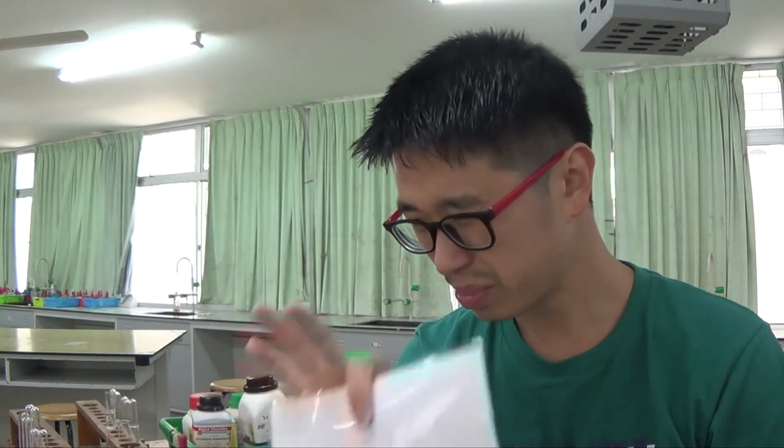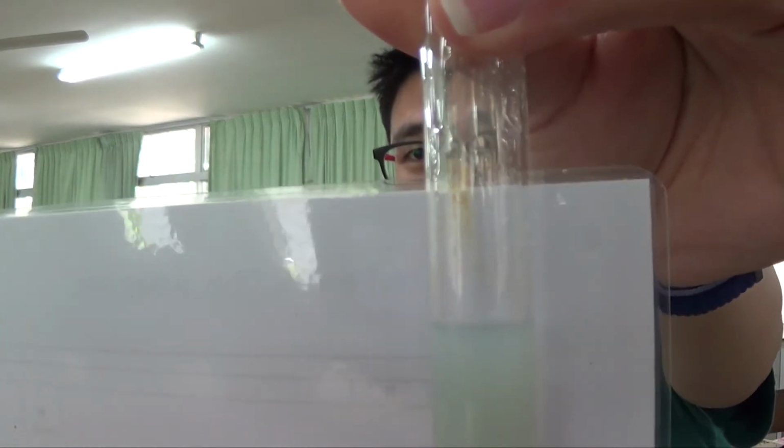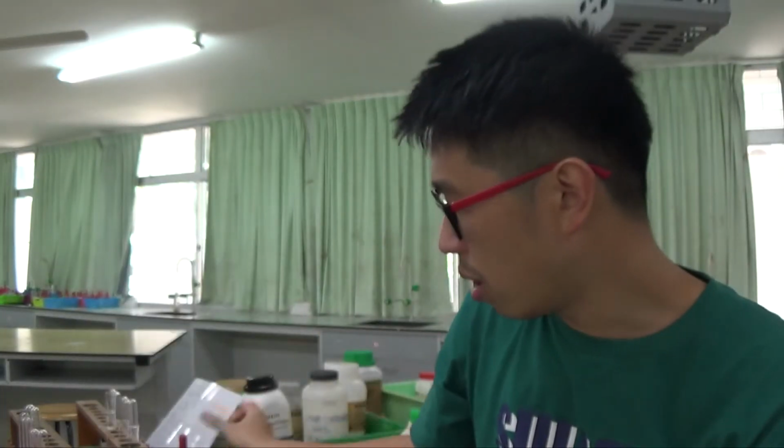It's not very concentrated because remember I only scooped out a very small amount, whereas in the real exam, Cambridge will ask the centers, will ask the supervising teachers to prepare the solution to a particular concentration. It will be easier to observe the changes. All I did just now was just a very tiny spoonful. It's not to an exact concentration, so it's not going to be super exact, but you can see it's colored, and that is a result of chromium 3 hydroxide being formed. But I did not add sodium hydroxide, I added ammonia. Then where did the hydroxide come from?